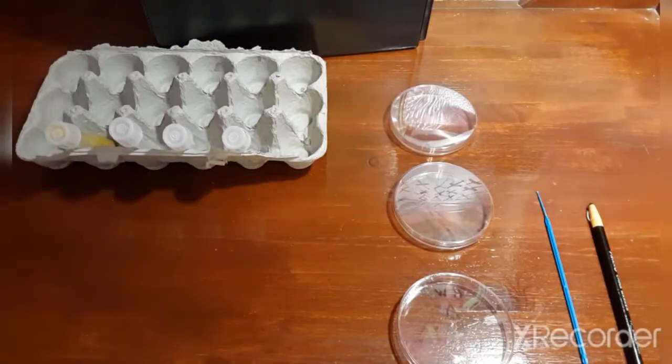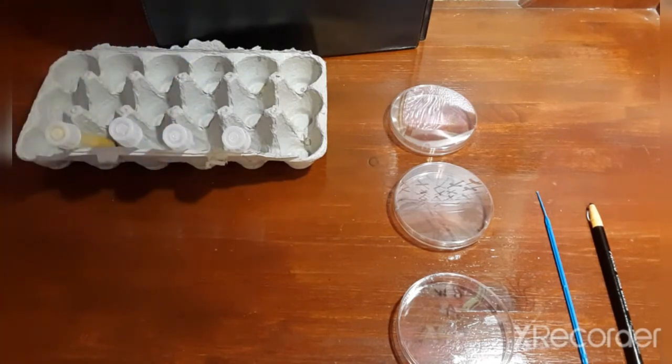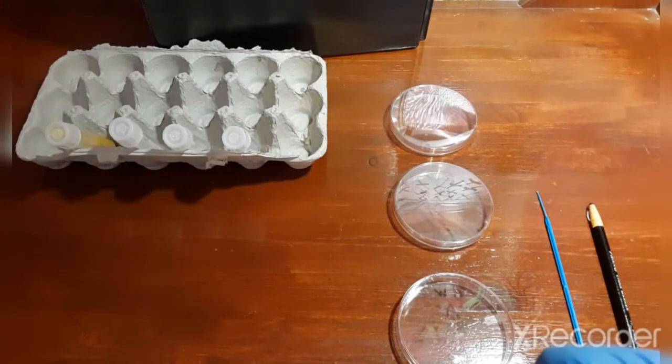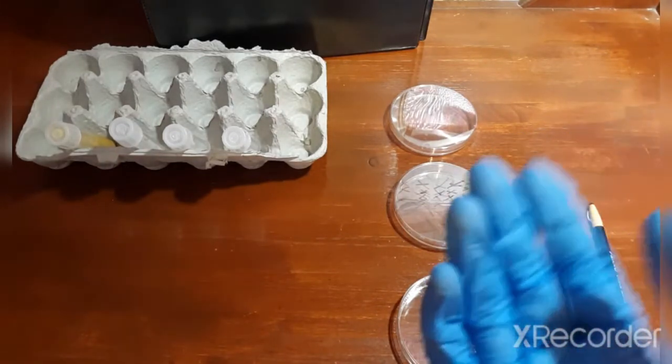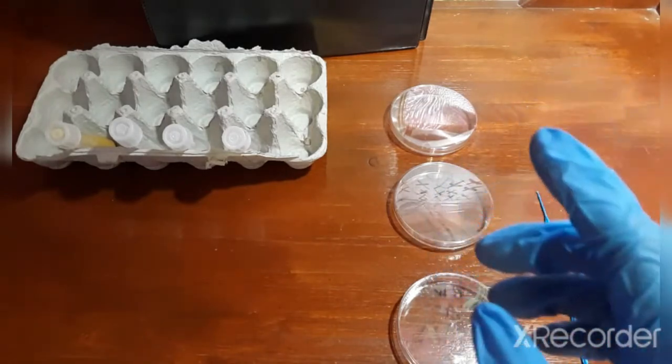Then obtain three molten nutrient agar deeps from your instructor and let them cool in the test tube rack. I don't actually have a test tube rack, so we're going with this. You want to let them cool down until they're warm to the touch. Once they're warm, you can label the deeps A, B, and C.